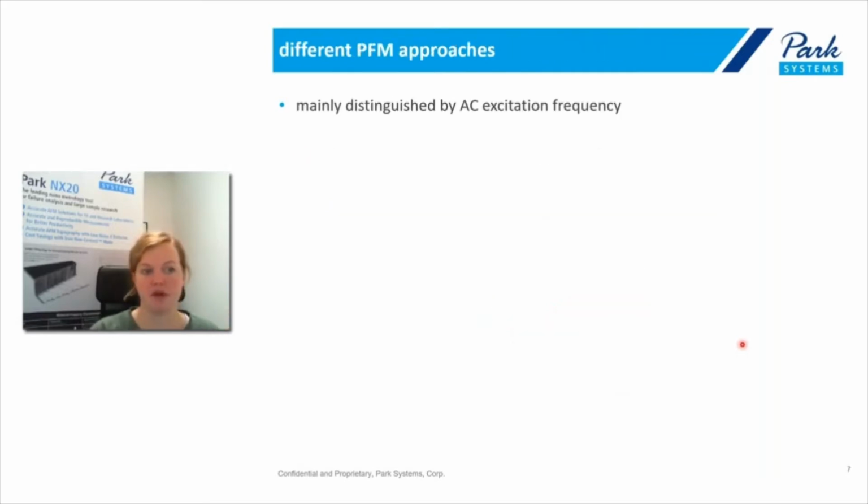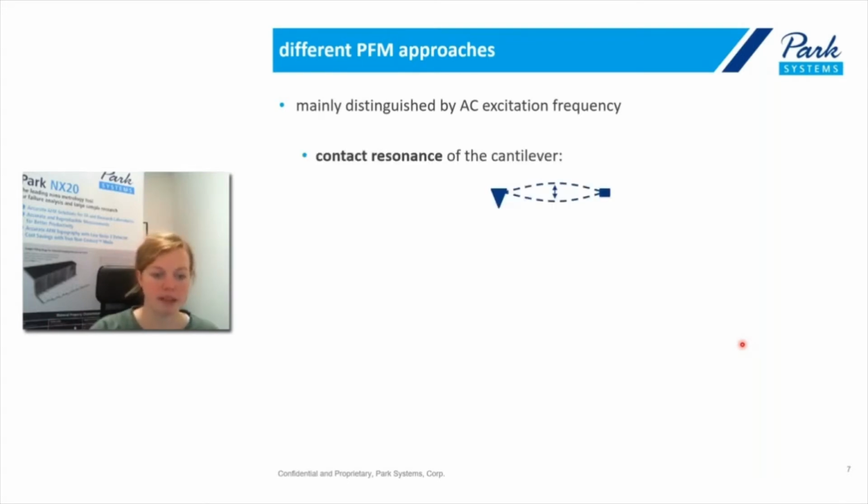Now there's different approaches to perform PFM. And the main distinguishing factor here would be the frequency that we choose for the AC excitation. And one important parameter or value here is the contact resonance of the cantilever.